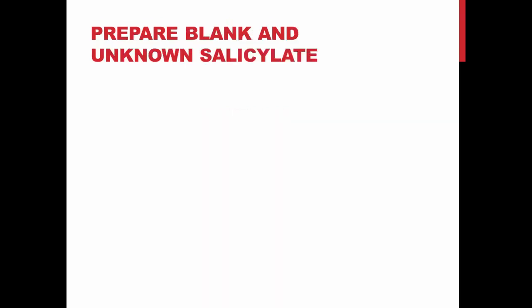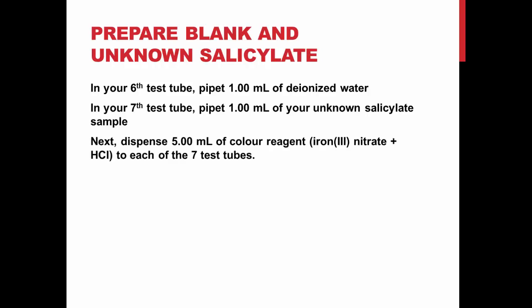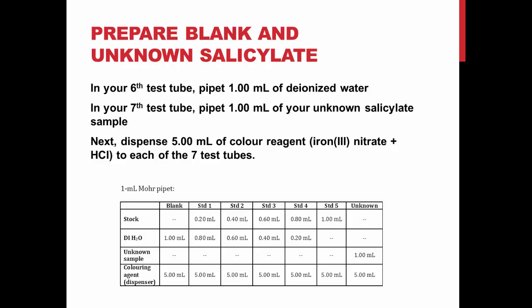Next, you will prepare a test tube containing a blank and a test tube containing your salicylate solution. In your 6th test tube, pipette 1 mL of deionized water as your blank, and your 7th test tube will contain a 1 mL aliquot of your unknown salicylate sample. Next, dispense 5 mL of color reagent — iron(III) nitrate in hydrochloric acid — to each of the 7 test tubes. This chart depicts the different reagents you will have in each test tube.